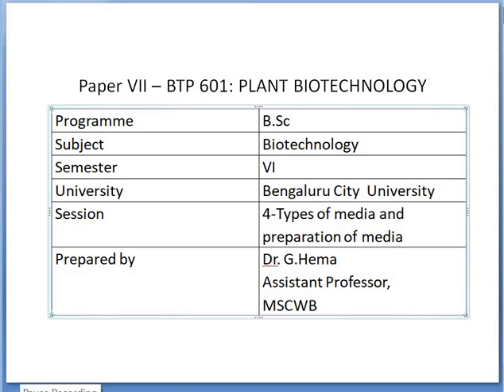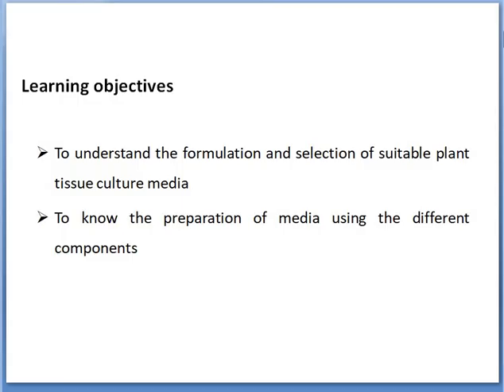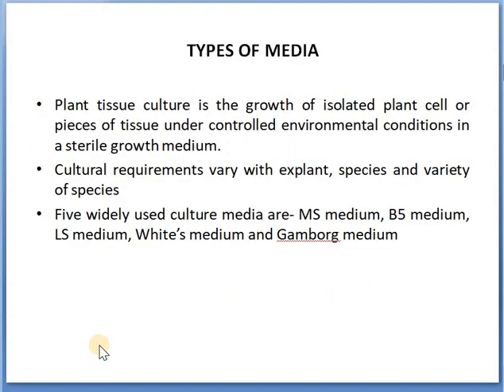Hello students, let us see how we prepare the tissue culture media using the different types of components in this video session. We will also learn how generally the selection of a suitable plant tissue culture media is done for the different types of plant species as well as explants. As we all know, plant tissue culture is the science or art of growing plant cells, tissues or organs isolated from the mother plant in an artificial media under controlled environmental conditions.